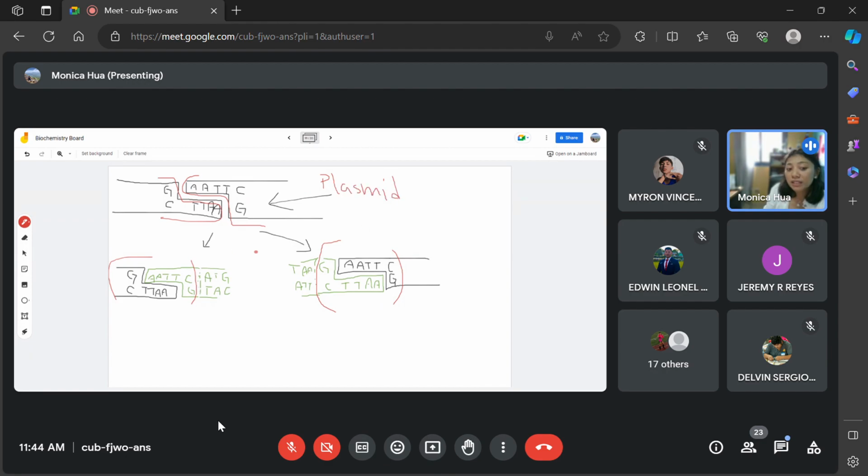And on your PCR sequence, it's also going to cut the restriction enzyme sites, which is this site and also this site. So when you anneal the DNA, you're going to anneal the template onto the plasmid. So basically, you cut out the plasmid and you insert the template, okay, using your newly created restriction enzyme sites. All right.